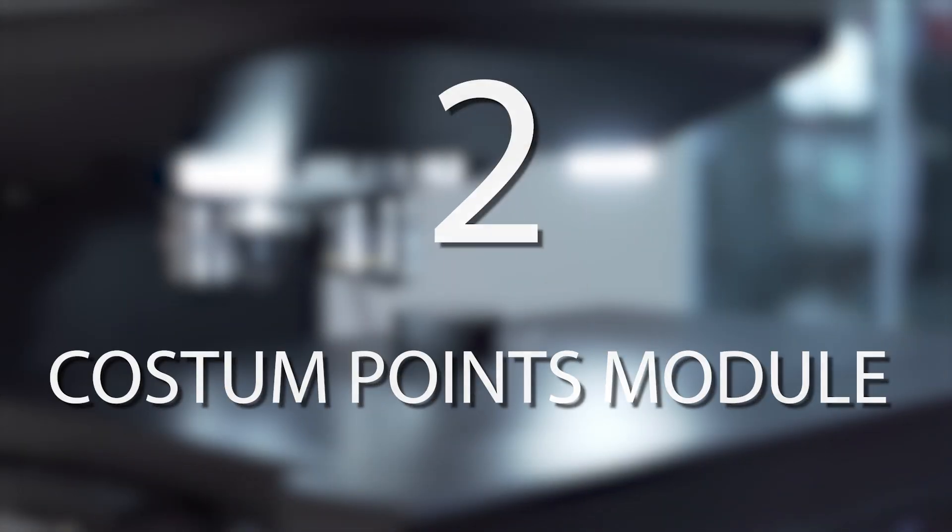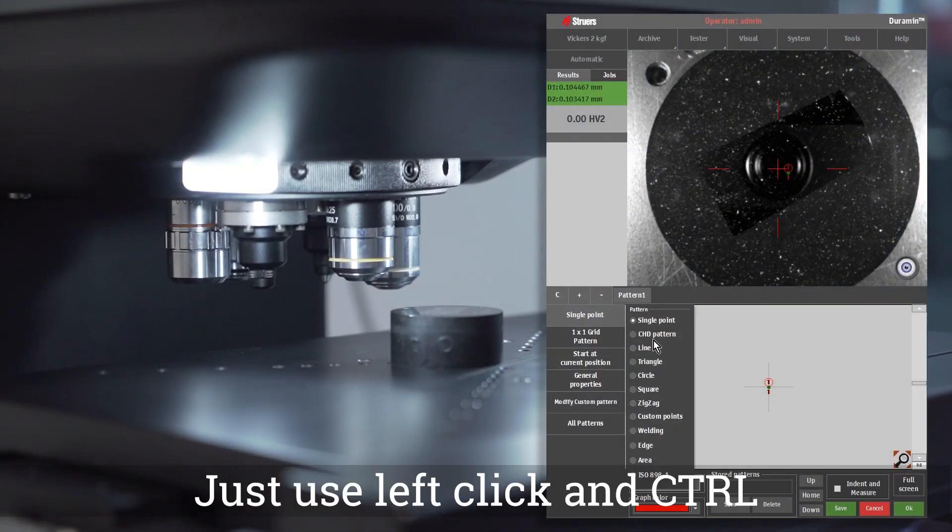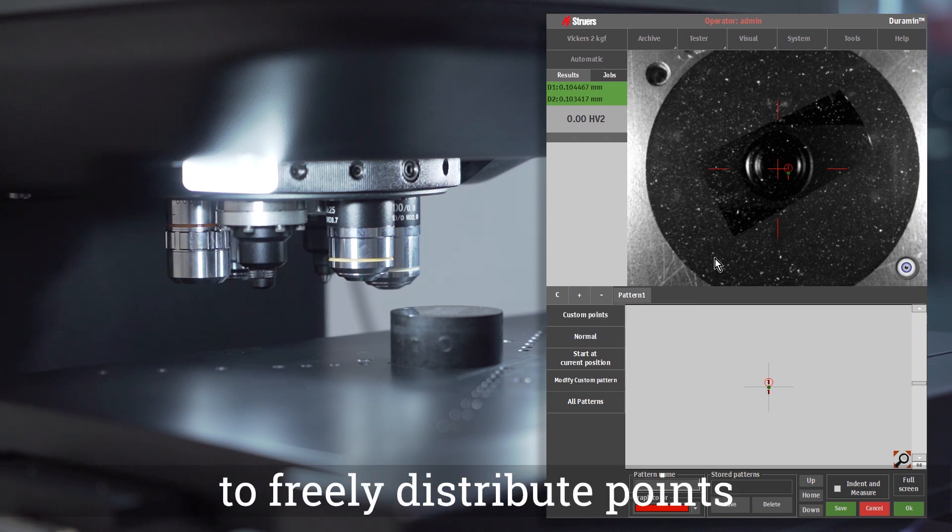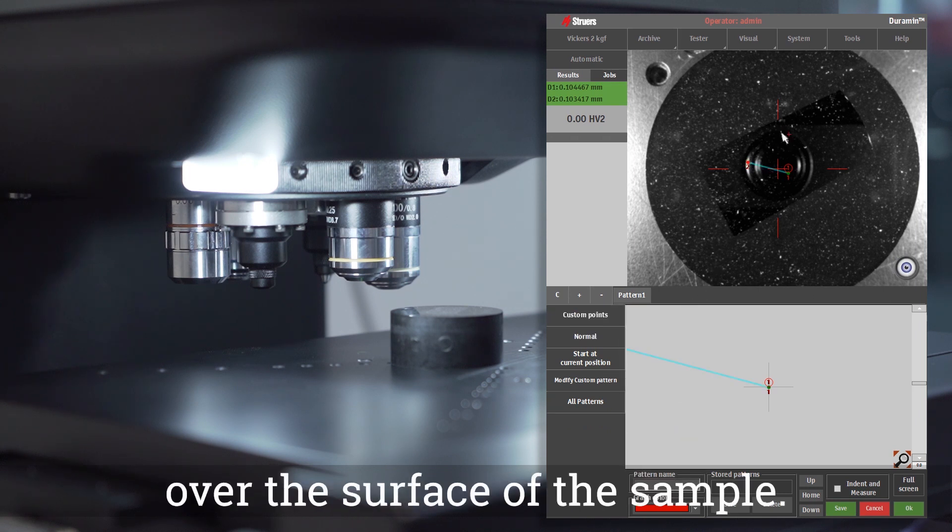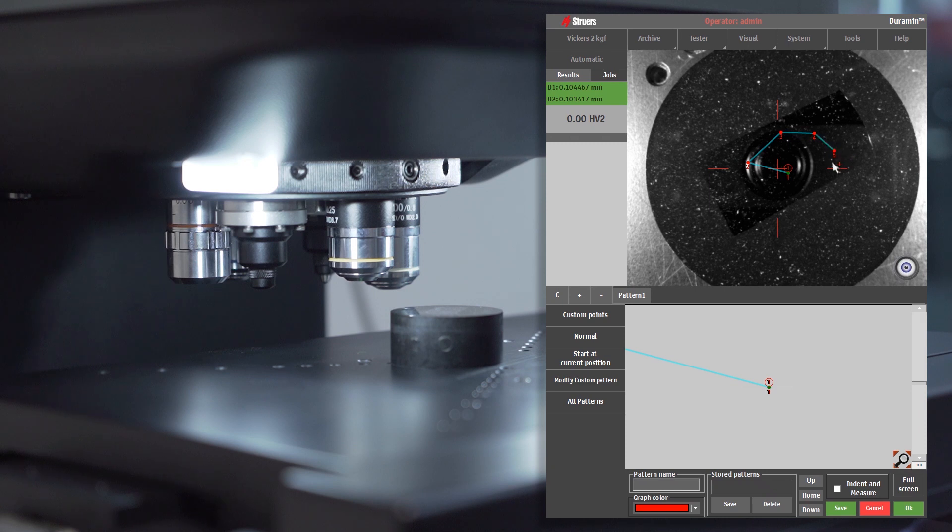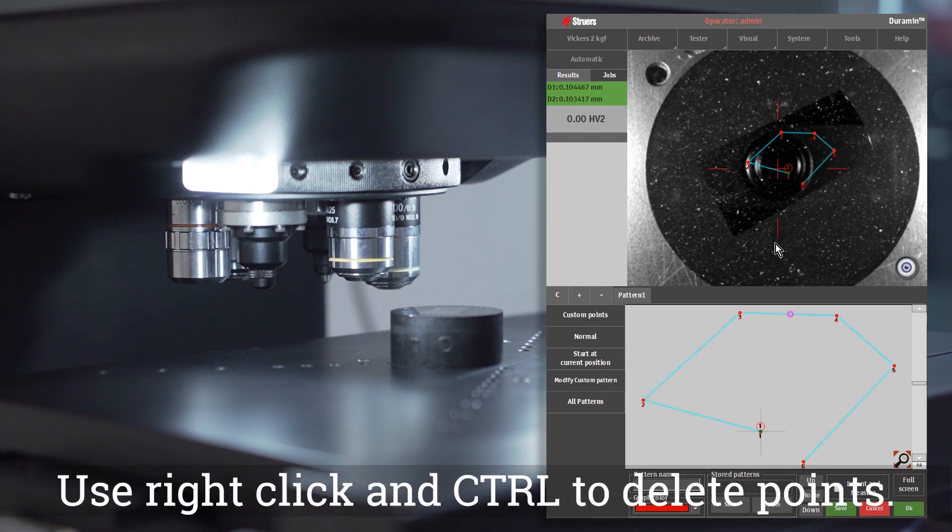Custom Points Module. Just use left-click and ctrl to freely distribute points over the surface of the sample. Use right-click and ctrl to delete points.